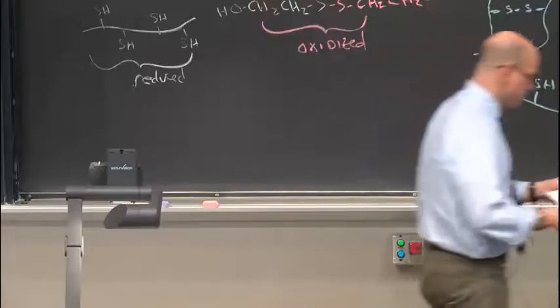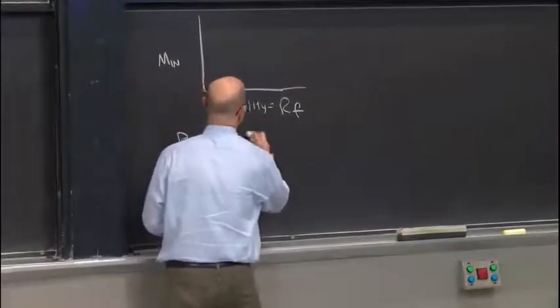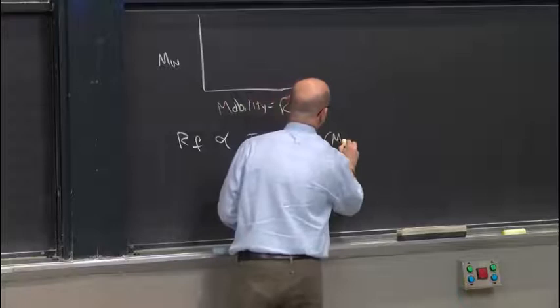Okay? And it turns out that the mobility is proportional to minus the log of the molecular weight.